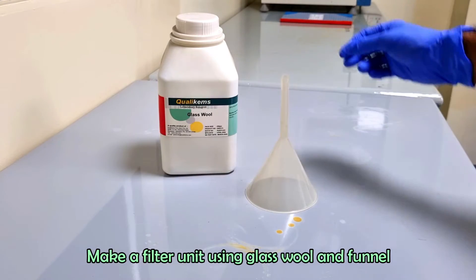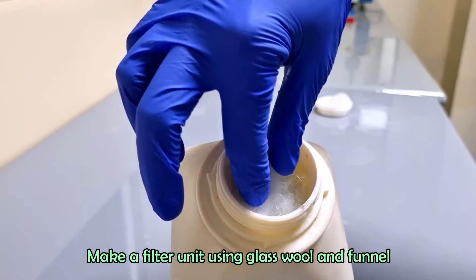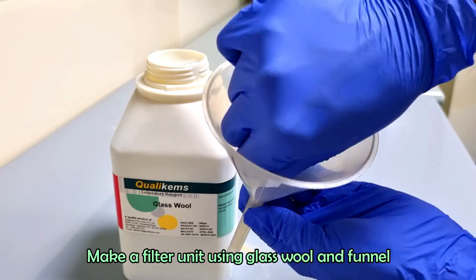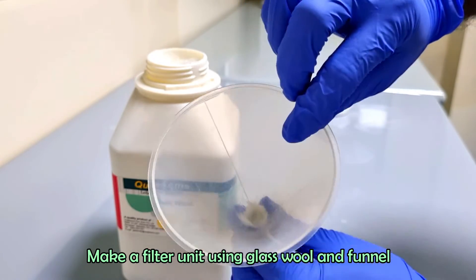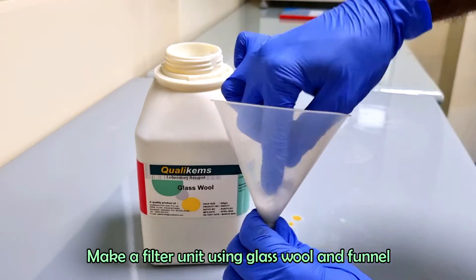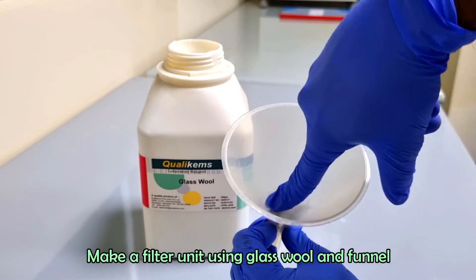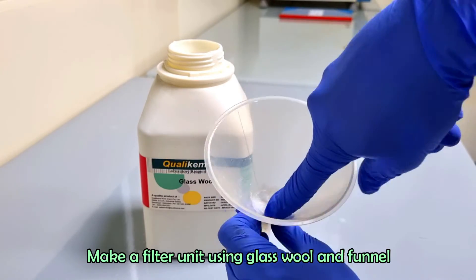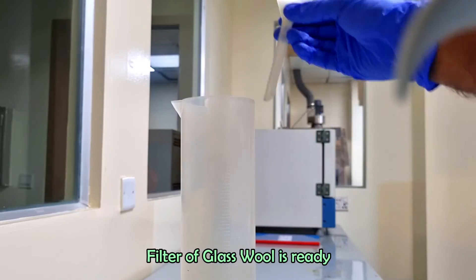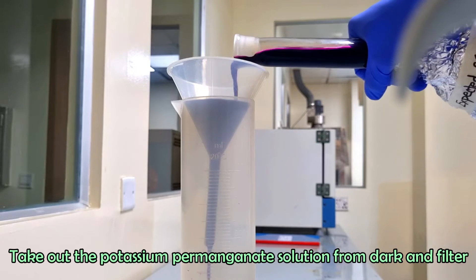Make a filter unit using glass wool and funnel. Take out the potassium permanganate from dark and filter the potassium permanganate solution using the glass wool filtration system.